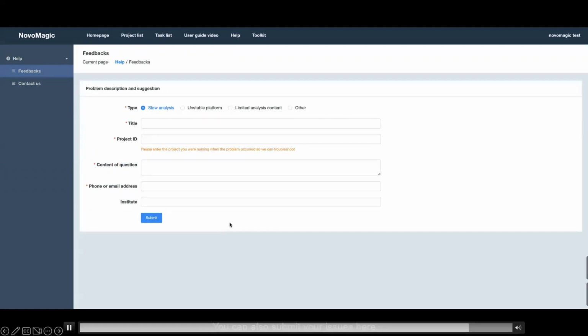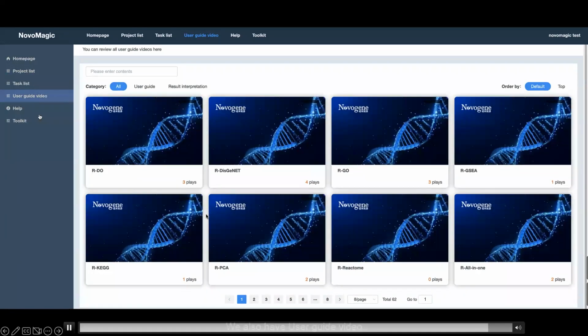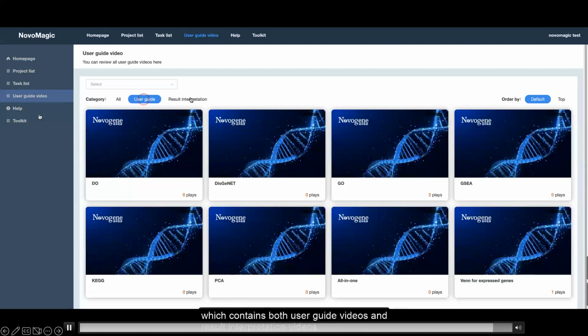You can also submit your issues here. And we also have user guide video, which contains both user guide and result interpretation videos. That's it, and I hope you enjoy this brief demo of NovoMagic.